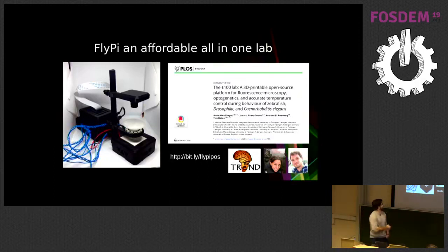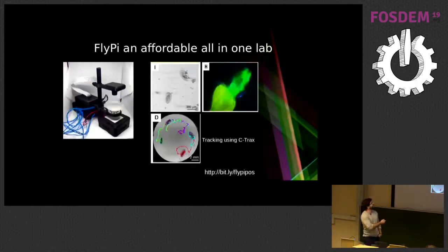And basically what this is, and I'm going to show this in a little bit, but basically this is what you can do with it. So these are 200 microns, and these are parasites that you can find if you drink bad water. So you can use this for diagnostics. You can use this also in a macro scale and not in a micro scale anymore, to analyze or record the behavior of small insects or small mammals.